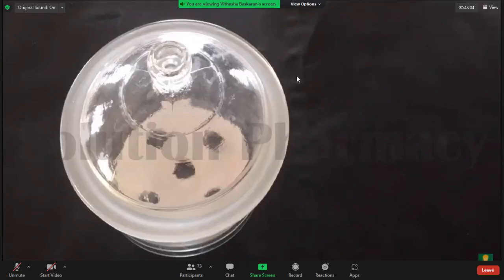And inside the chamber of desiccator, we place a substance which is a drying agent, and it is called a desiccant. Desiccants are substances which work by a process called adsorption, and they have an ability to attract, or you can say have a strong affinity for water, and these desiccants remove water vapor from the desiccator atmosphere and also from the substance placed in it.